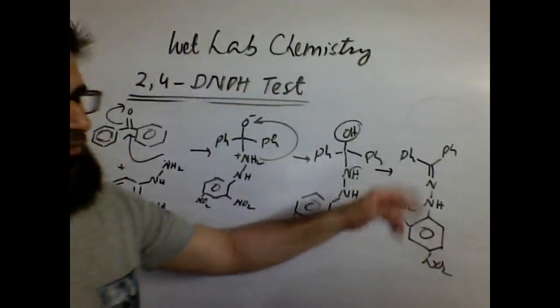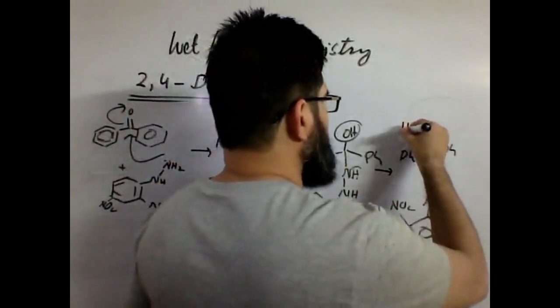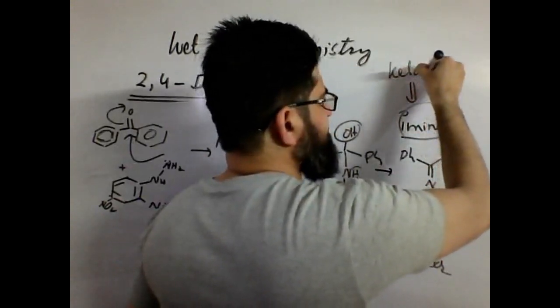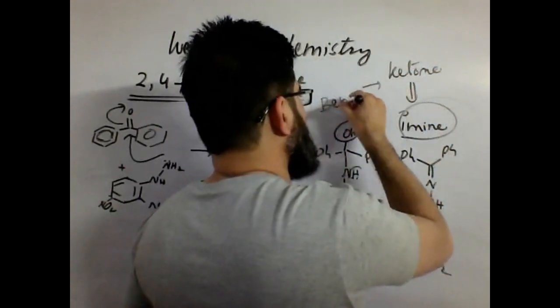So this will be the product. This product has been generated from a ketone, which in this case is benzophenone.